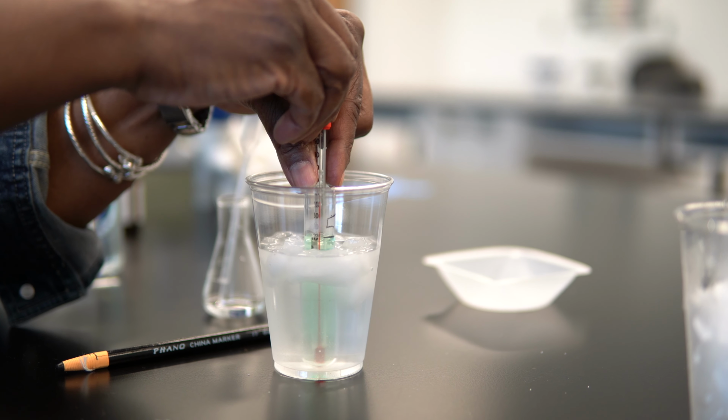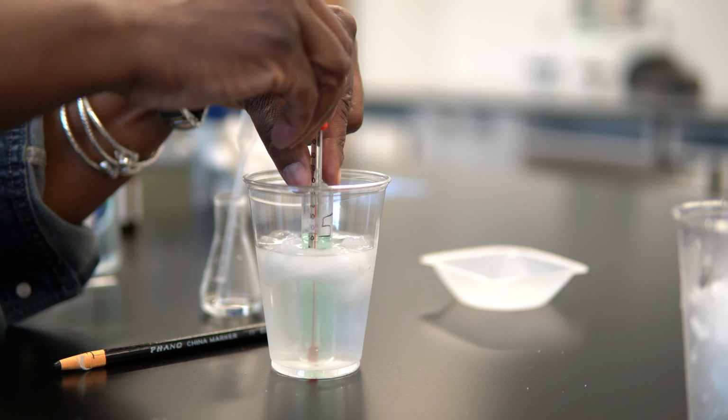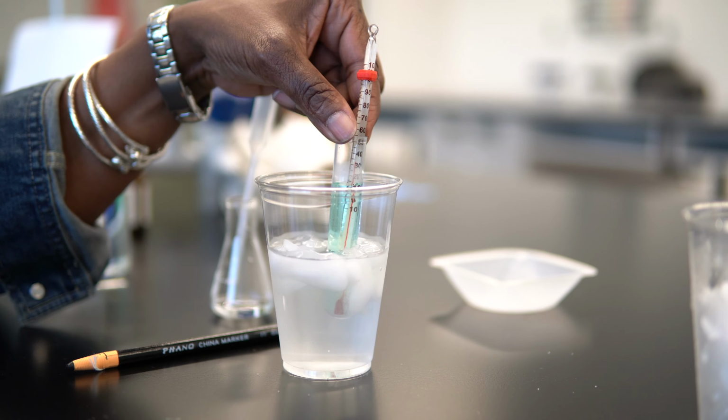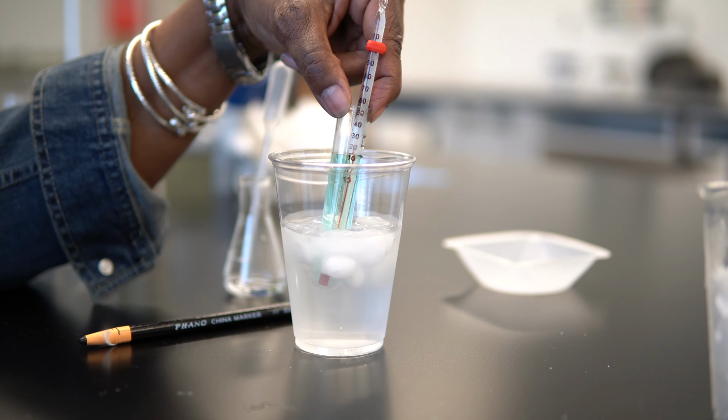Now place test tube number 5 into the cold water bath. Gently stir the solution with the thermometer until the temperature is less than 10 degrees.